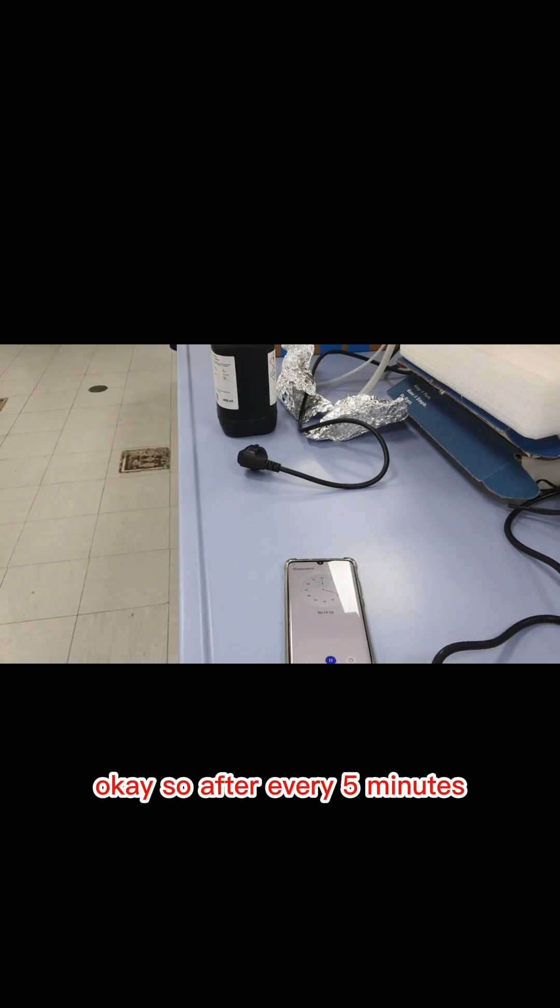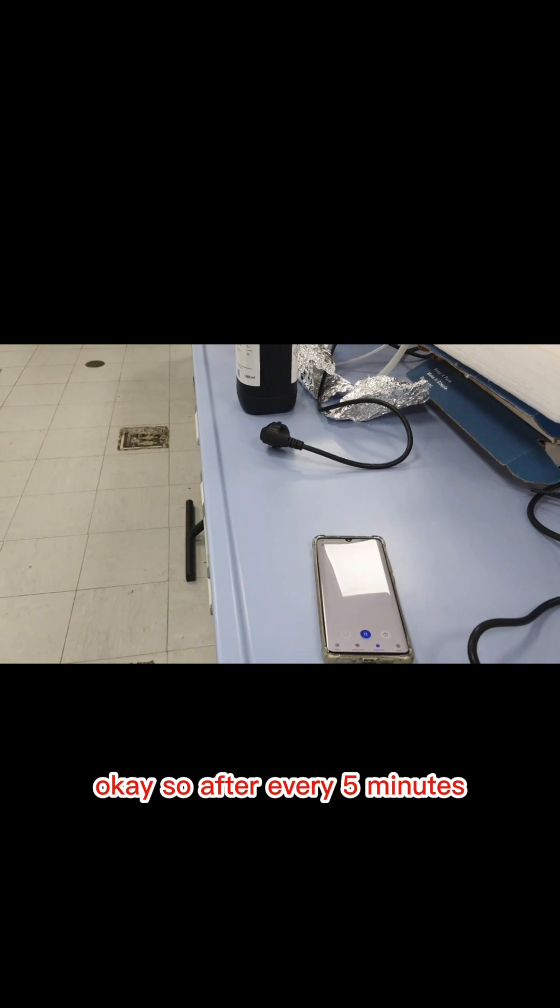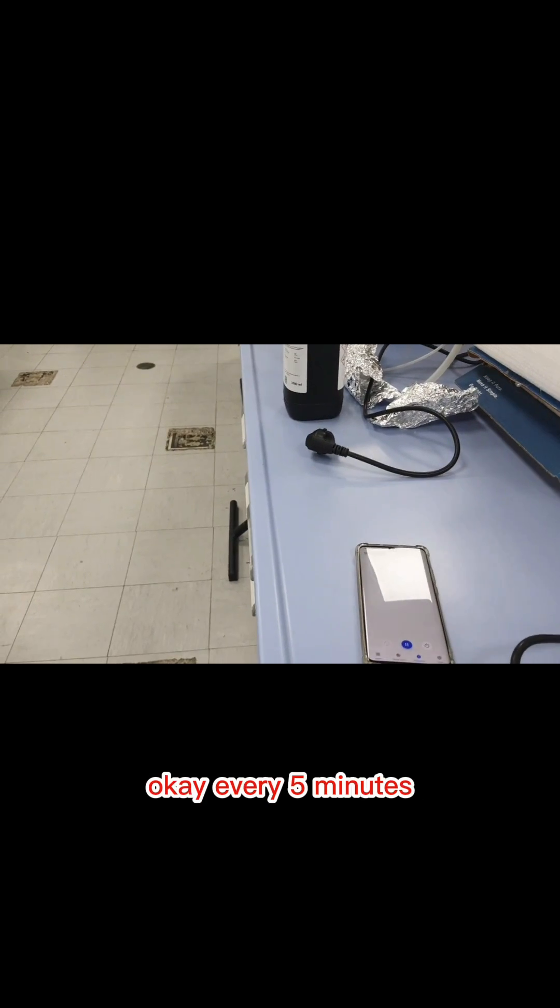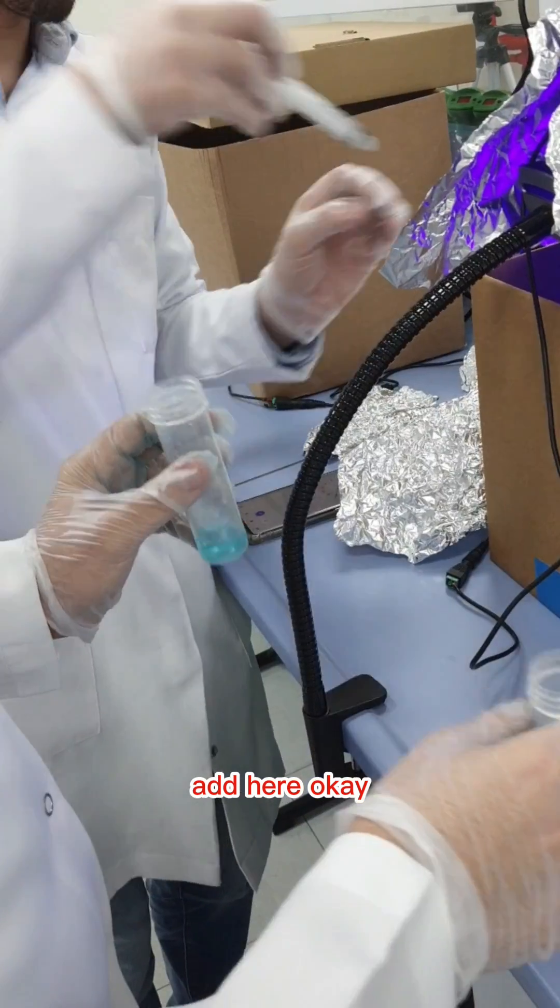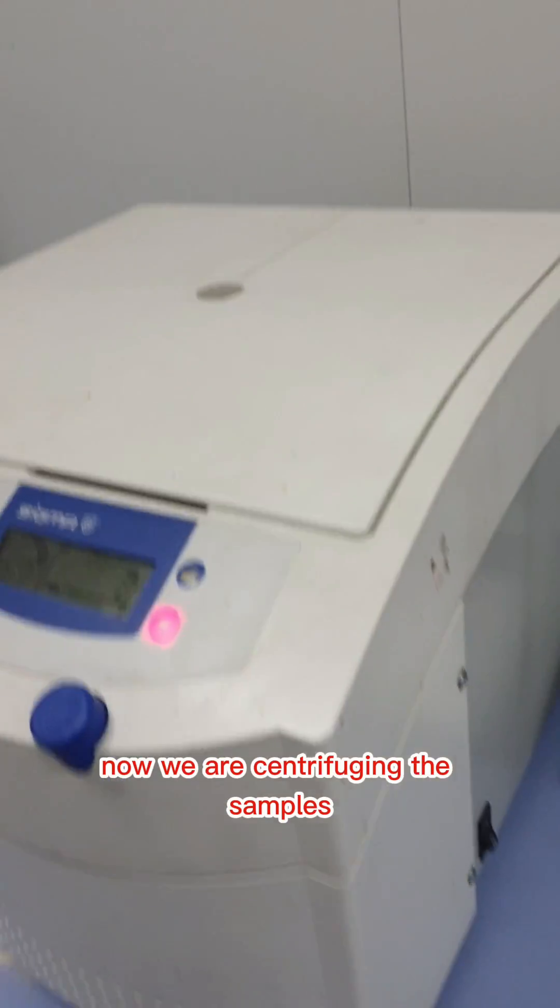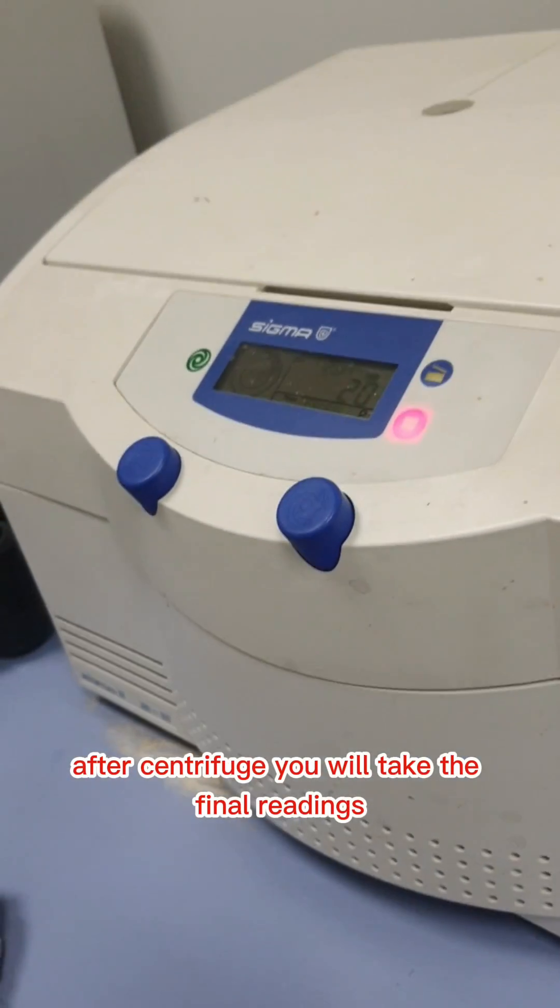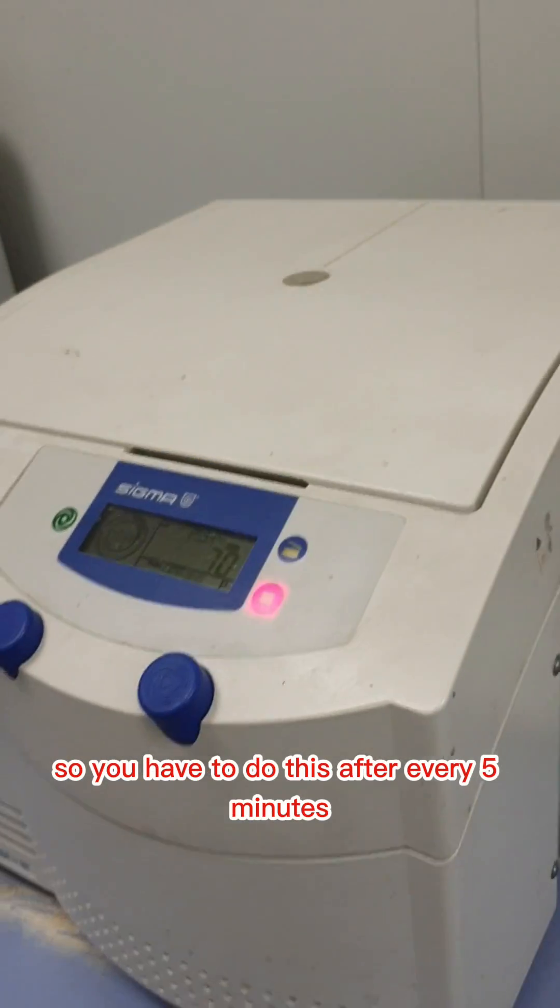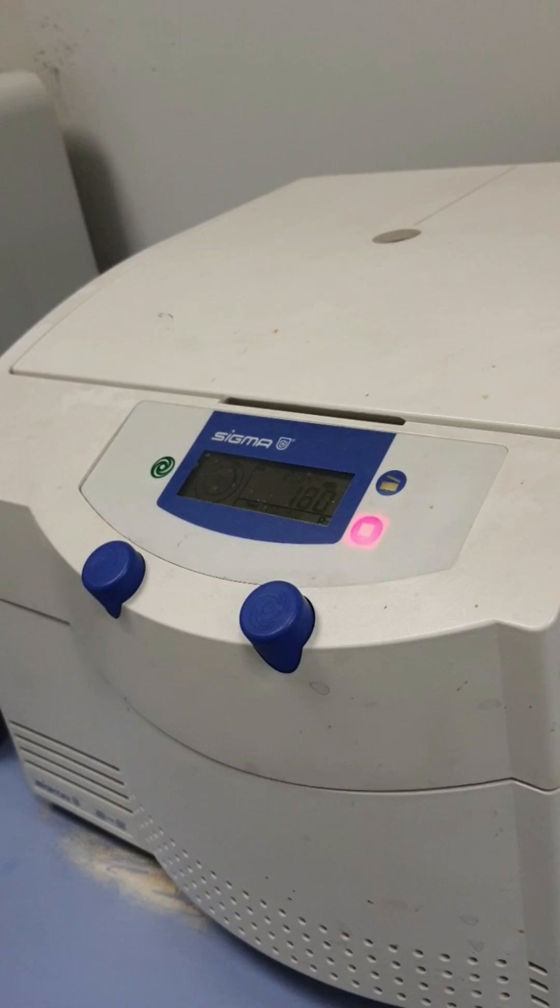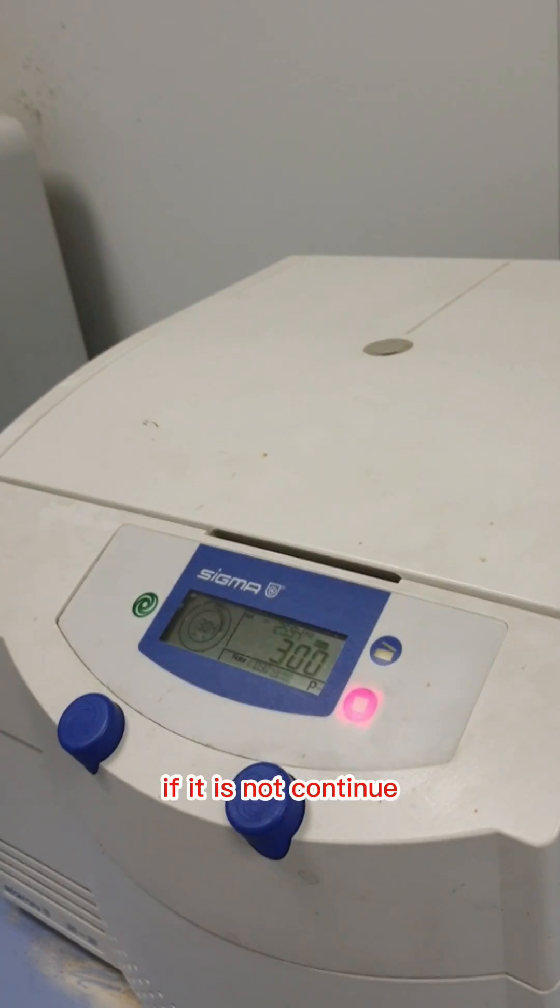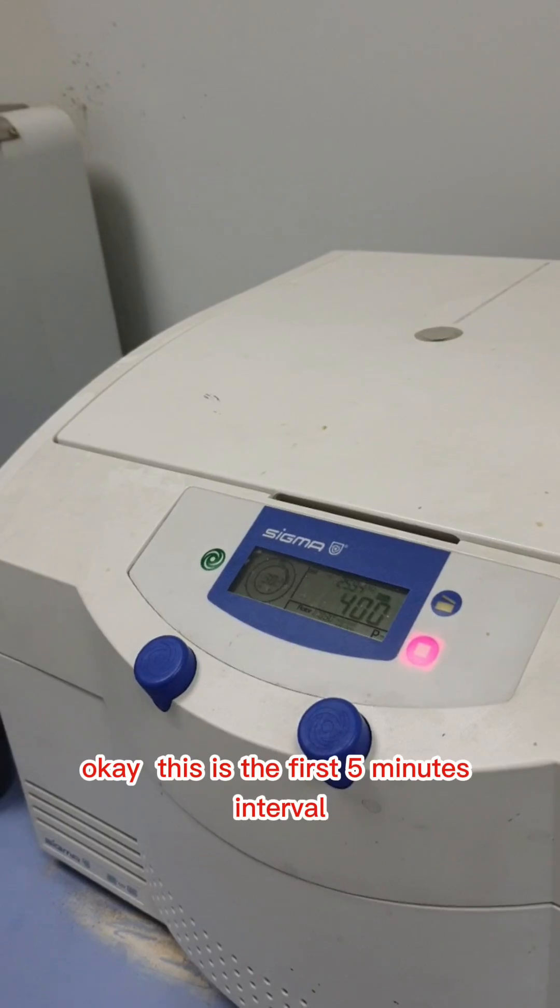After every 5 minutes, you have to take out the sample. We are checking out the samples using a syringe. Now we are centrifuging the samples. After centrifuge you will take the final readings. You have to do this after every 5 minutes till half an hour. If it is 100% removed, stop. If not, continue more 15 minutes.